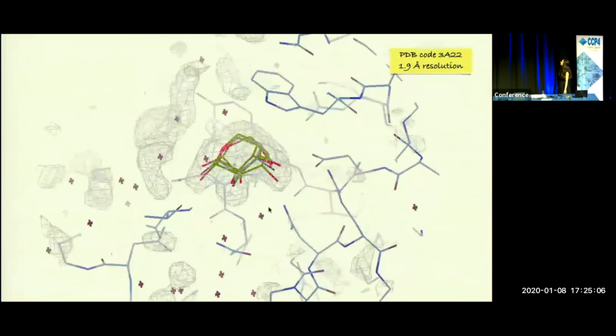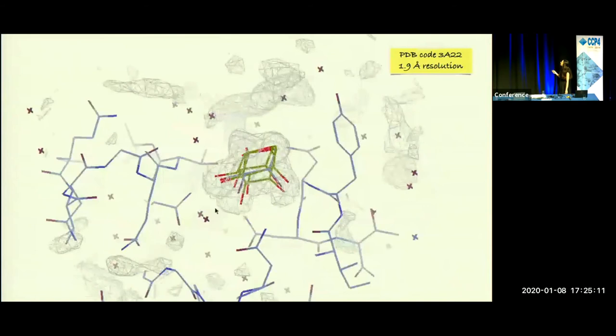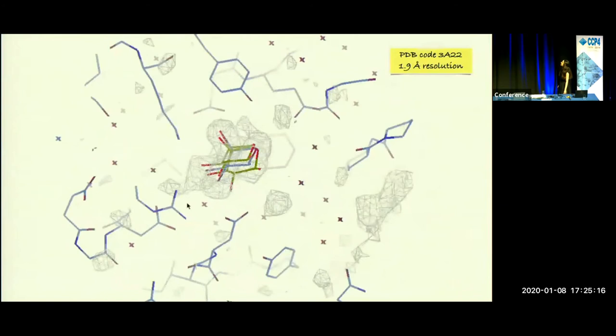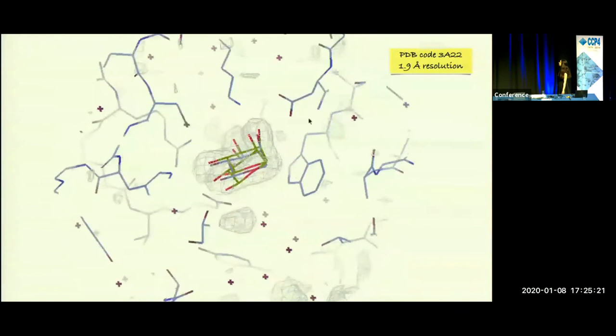This is an example of detecting sugars with CELS. Here you can see a few options for an arabinose. In blue is the correct one from the deposited model, and in green are the ones detected by CELS, which are quite close.